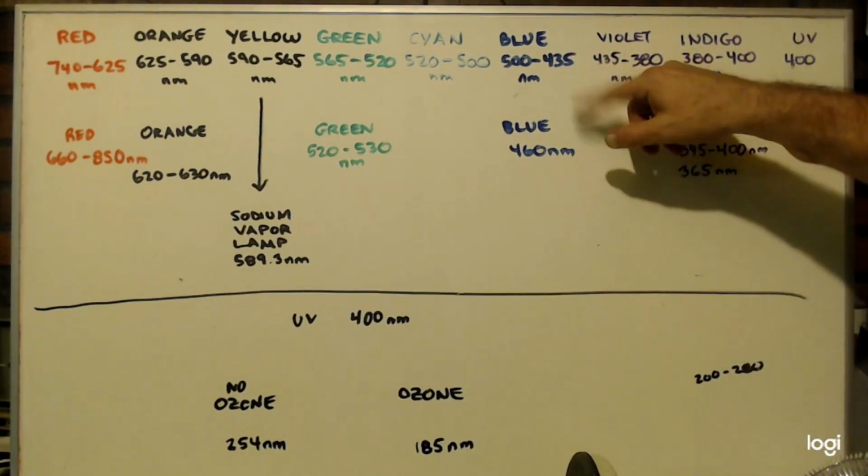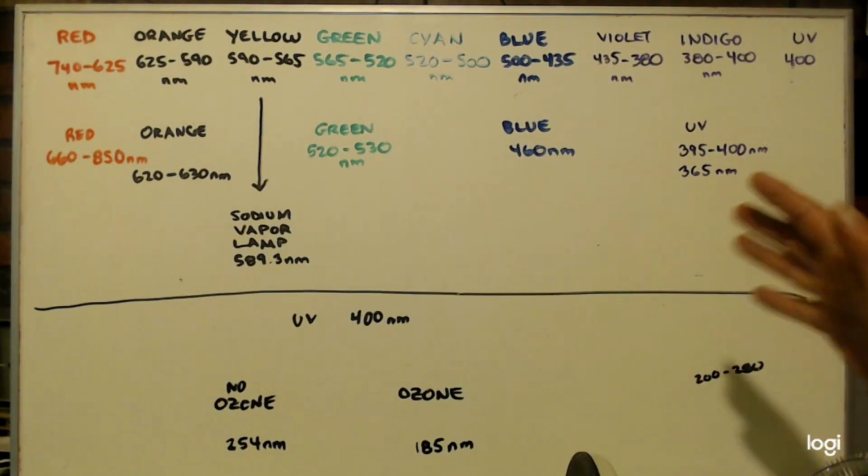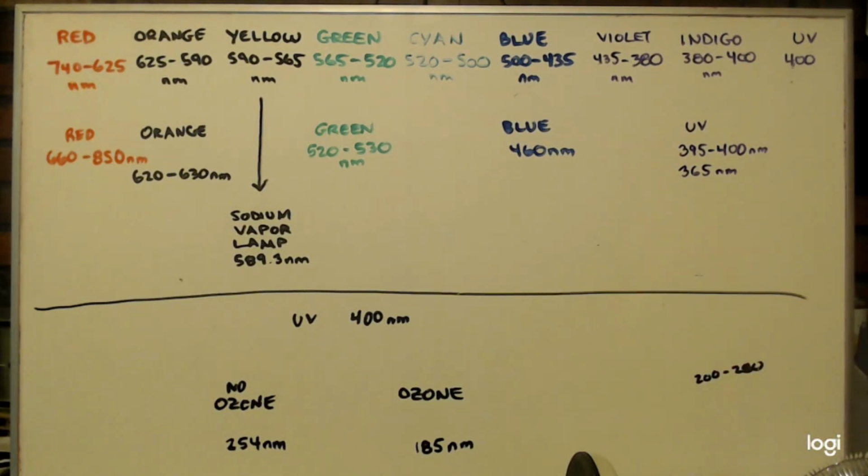I actually did a video where I proved that blue light will make chlorine radicals from chlorine gas, and that's all you need, this blue light. But LEDs, because I did a video once about halogen lights. Halogen lights suck, okay? I thought they were okay for some things. They suck, because most of the light is just all over the place. When you buy LED lights, they have a narrow range of wavelength of light that they're producing. And that's what you really need, okay?